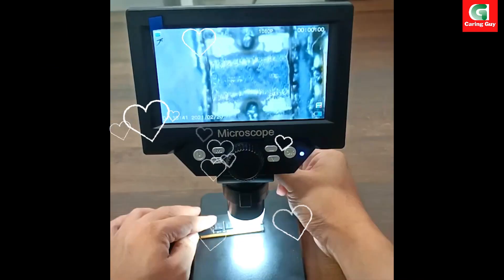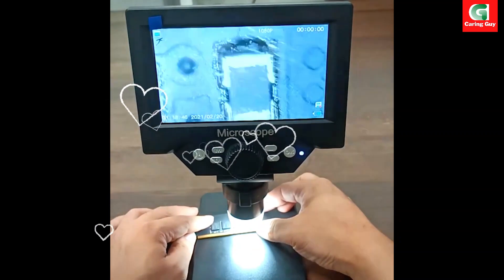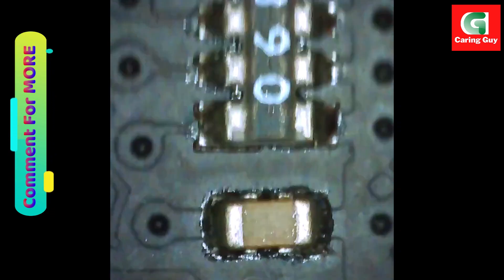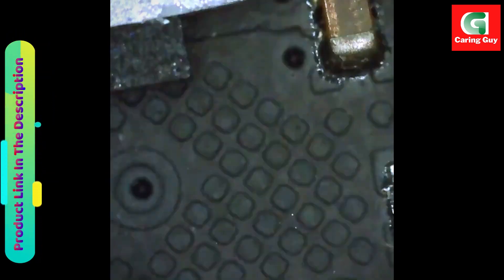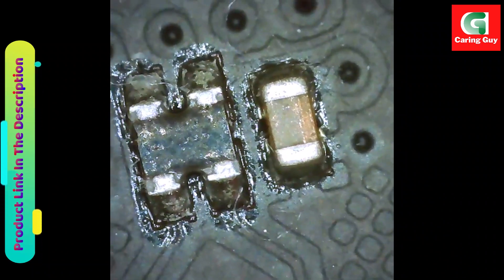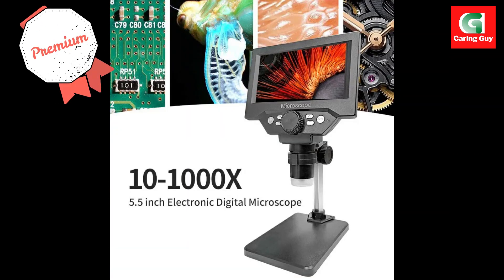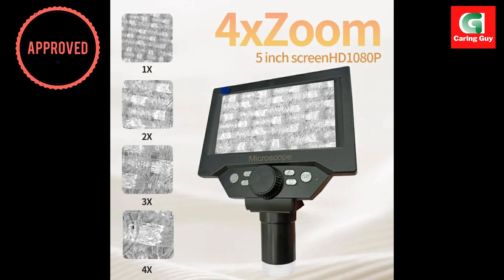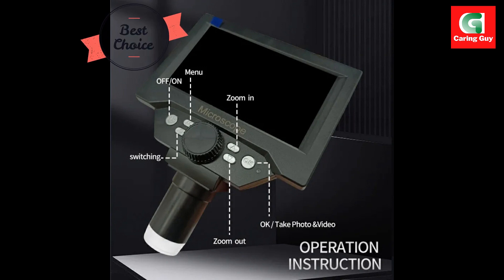Digital features: equipped with advanced digital features, this microscope facilitates easy capture and viewing of images. The digital functionalities also include the ability to adjust magnification and focus digitally, enhancing the overall user experience. These features make the microscope versatile and user-friendly for various applications.